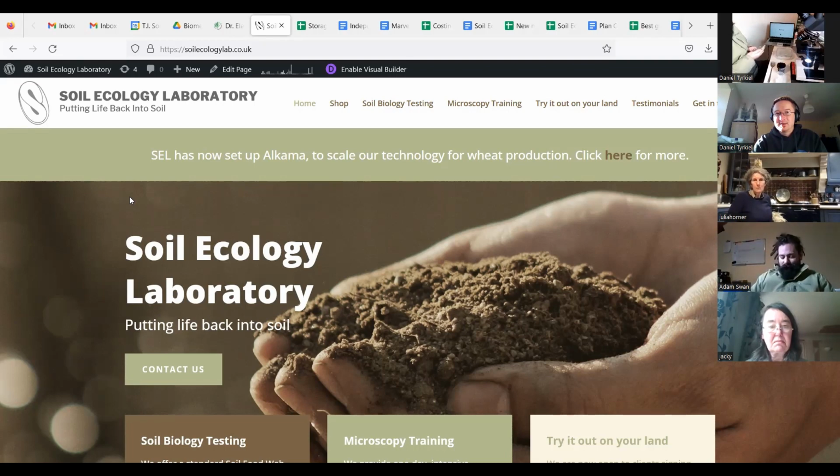And the premise of it is that what you see is what you get. So the idea behind the use of microscopy is that if you see something, it's there. If you can't see something, then basically you have to assume that it's not really something that you can expect an effect of. And the reason I say it that way, I'm not saying that it's not there, by the way, because microscopy is not an ideal tool for everything.